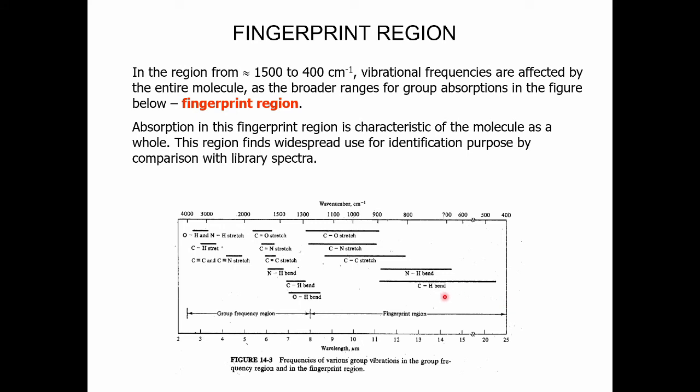So here we can kind of see the different stretches. Notice how we have the hydrogen stretches from nitrogen and carbon bonds, as well as carbon-carbon, carbon-nitrogen, carbon-oxygen stretches. So this fingerprint region that we see here is very indicative of the whole molecule itself. Meanwhile here, going from, I guess, 1200 to 4000, we can see different bends and stretches that are more akin to the functional groups. And these are usually the ones that we read.